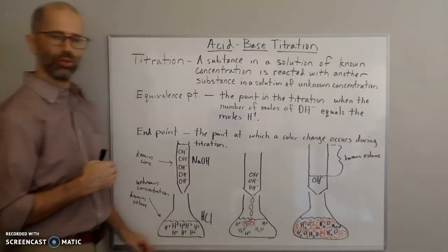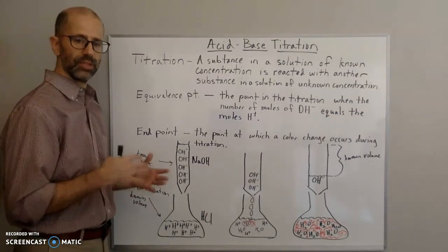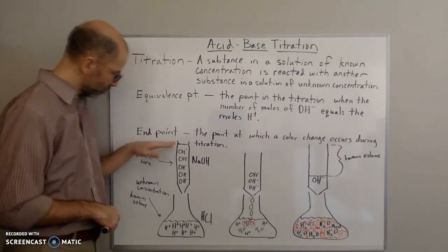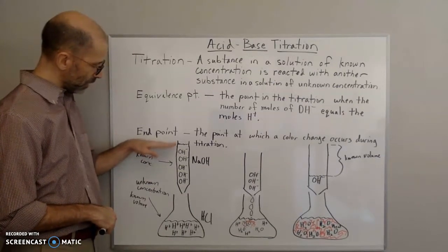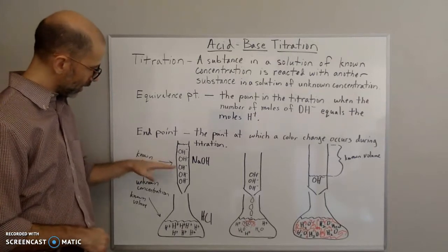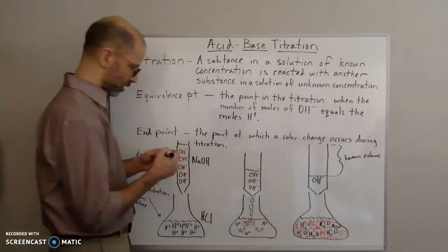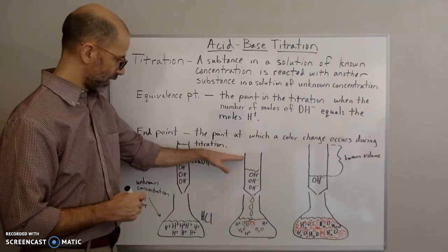But when the phenolphthalein is in a basic solution, it's going to turn pink, right? So when I'm adding my base, here's the volume of my basic solution, my NaOH solution. So when I'm starting, I'm going to start to add NaOH. So here's the NaOH. I'm starting to add, and let's indicate here. So it was up here, and now I'm adding my NaOH.